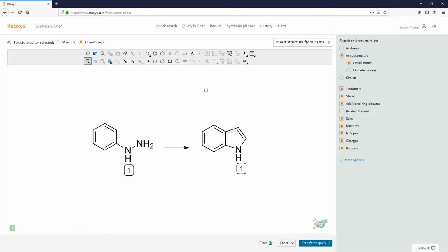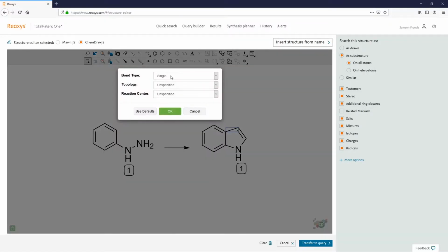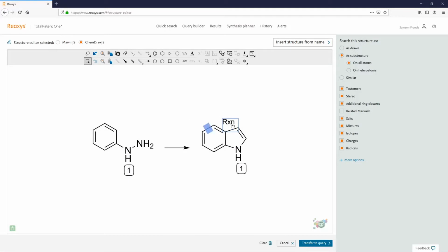Use your Select tool, select the bond. This will activate the atom properties. So show properties, and you'll see in here this has now been configured for bonds. So we'll change this to make or break and click OK. You'll then get a marker. Simply hover above this to view the rule that's enforced.